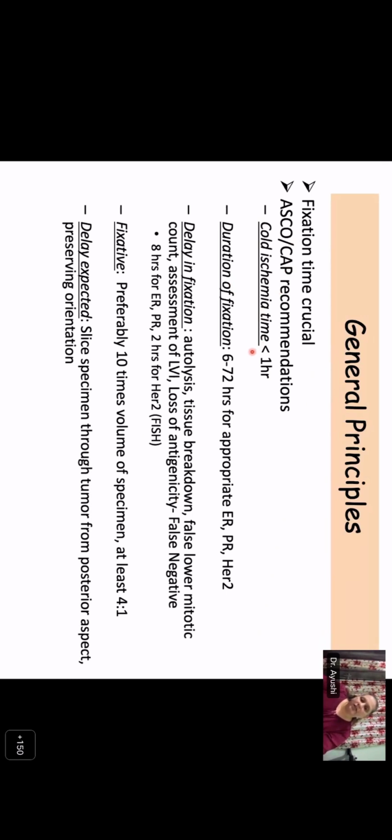The duration of fixation should be not less than 6 hours and not more than 72 hours for appropriate evaluation of the biomarker status. The amount of fixative should preferably be 10 times the volume of the specimen, and at the very least 4:1.